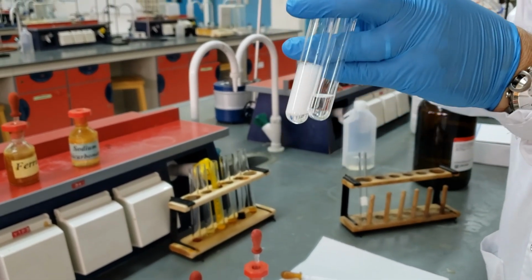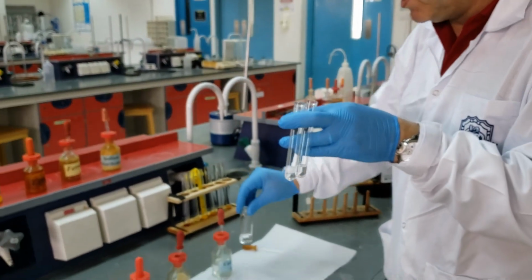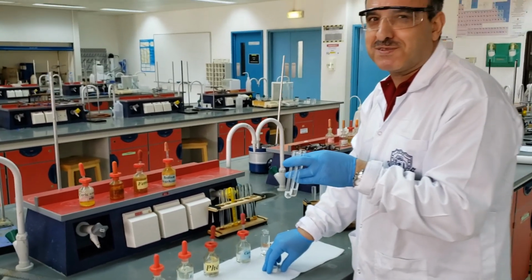Oh, we have a match now. That means our unknown compound here has the same functionality as the last known compound, which is carboxylic acid, and thus the goal of the experiment has been achieved.